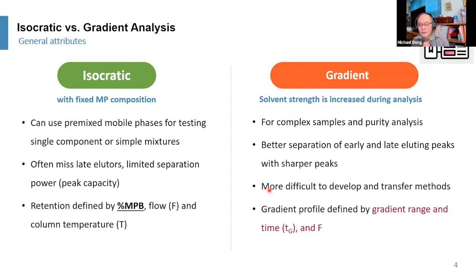Now, recalling that in reverse phase chromatography, the retention mode is the hydrophobicity of the analyte, right? Meaning that if you have a compound which is very hydrophobic and not water soluble, then your retention time is going to be later. Or for something that's water soluble, you have no retention or a very small retention time.